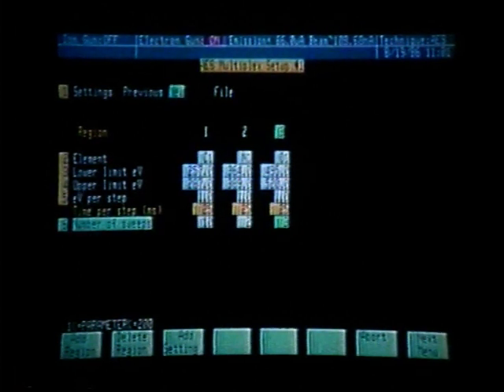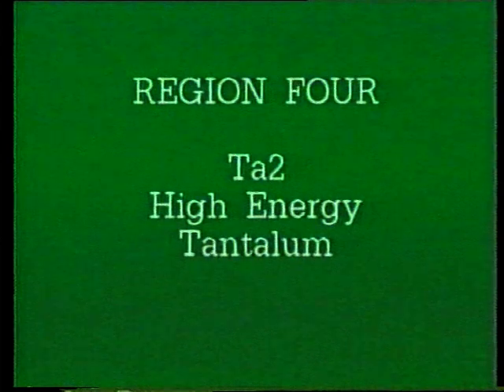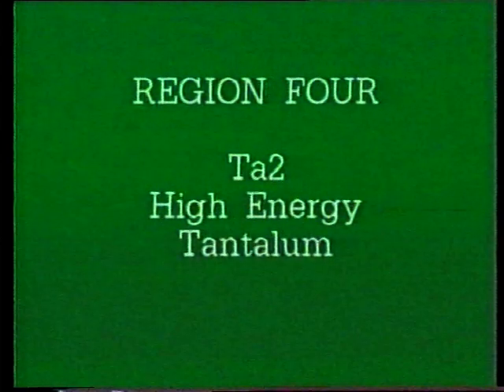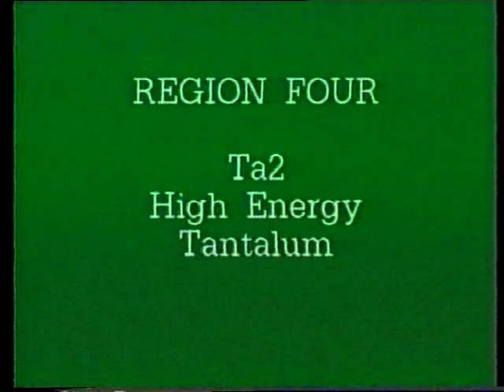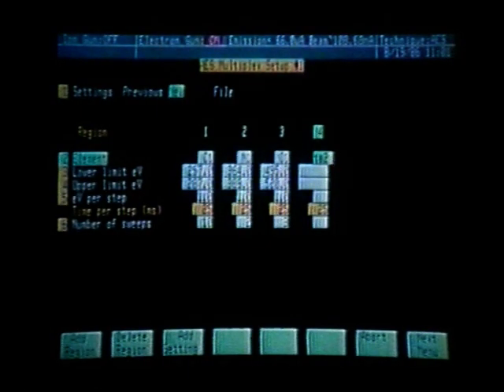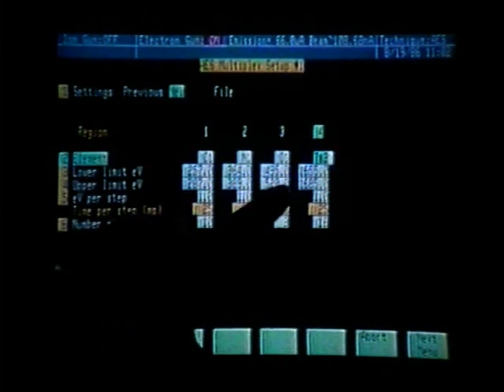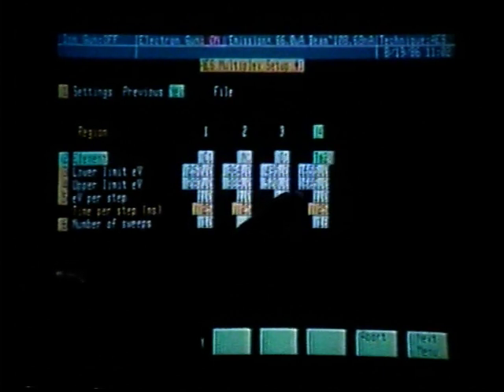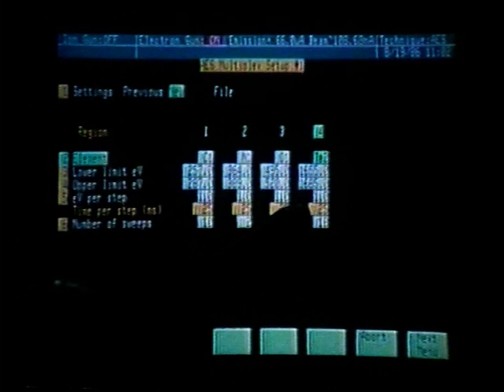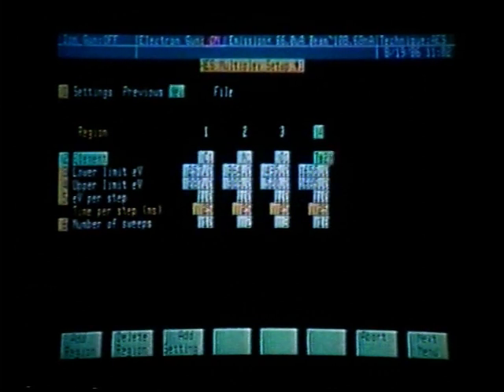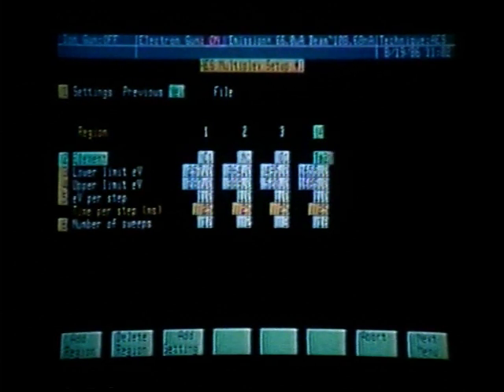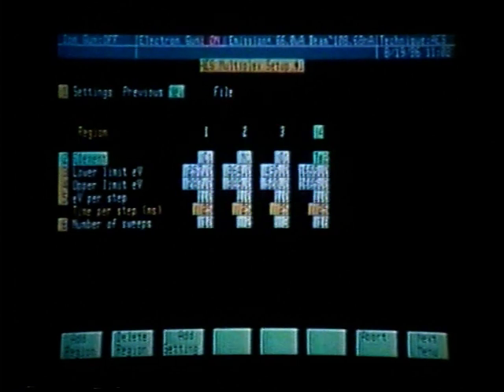Again, we are ready to add another region with soft key number one. Region four will be tantalum — we want the high-energy tantalum peak, so the acronym should be TA2. TA1 would be the low-energy tantalum peak, TA2 the high-energy tantalum peak. Lower limit of 1655, upper limit of 1685, one volt per step. Number of sweeps is 18, but we decided we want one sweep on tantalum, so using function key number six we change the number of sweeps to one.